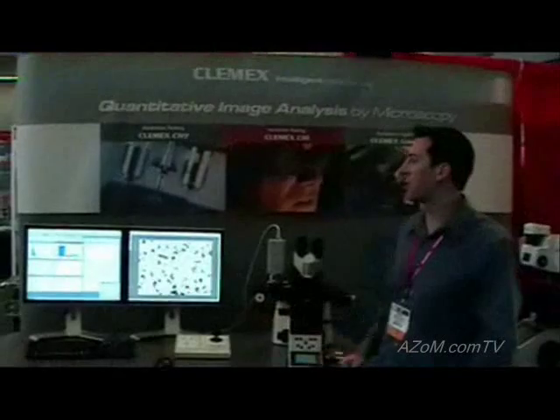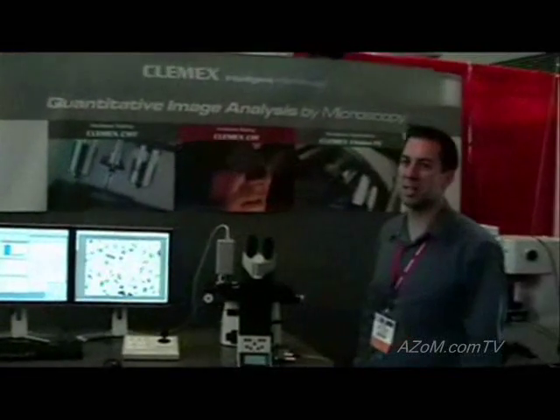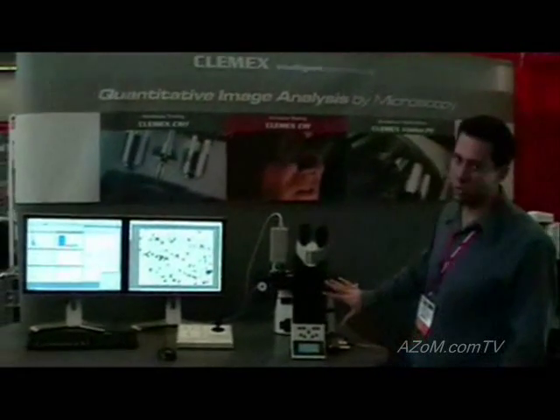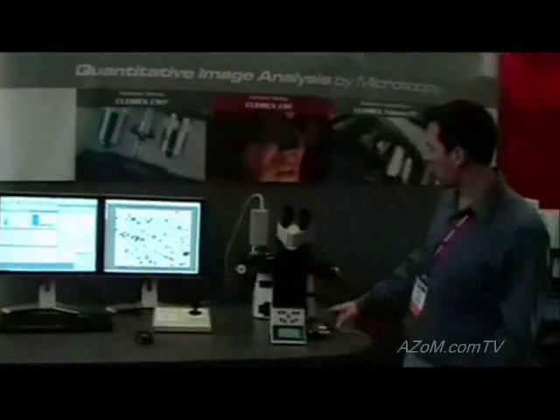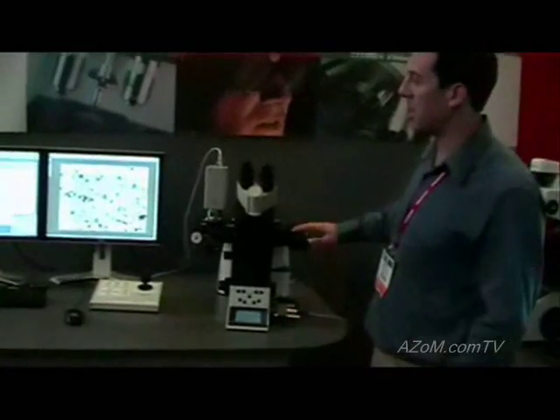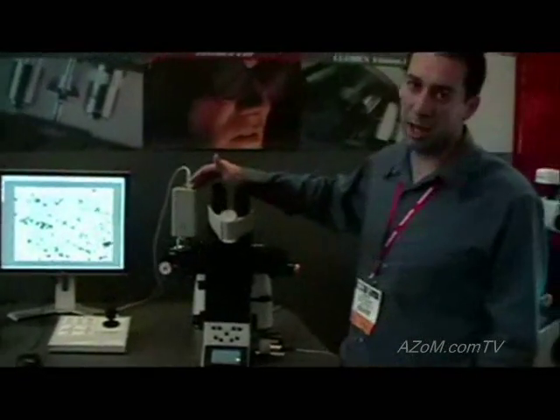This is one of our advanced imaging systems, comprised of a microscope, motorized focus, a motorized stage, and a camera.